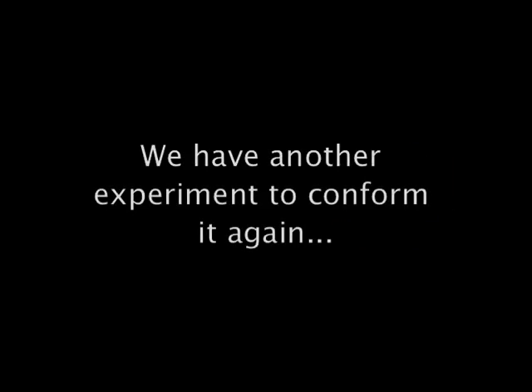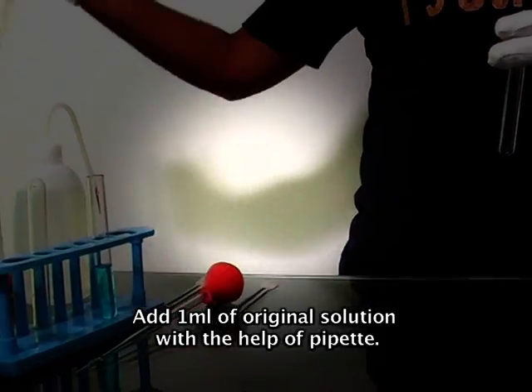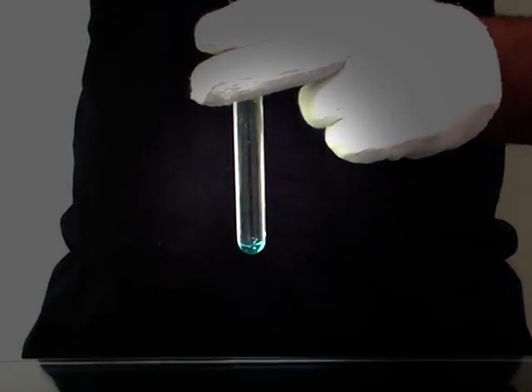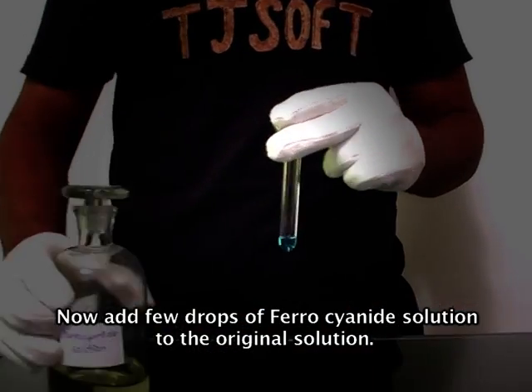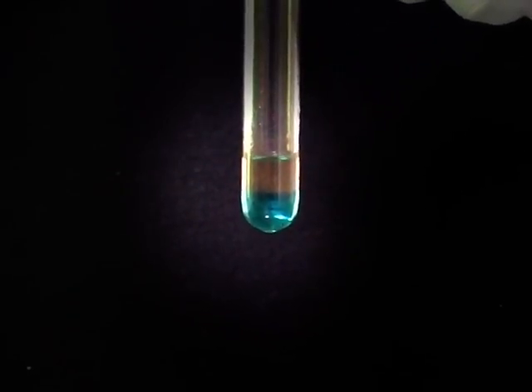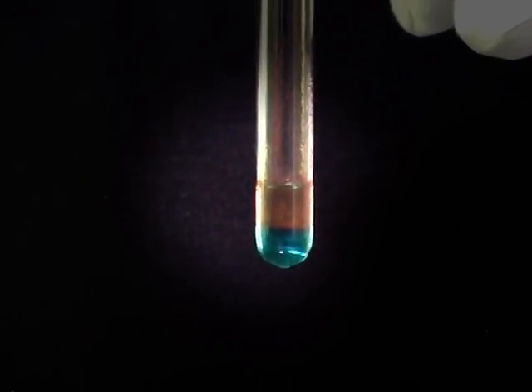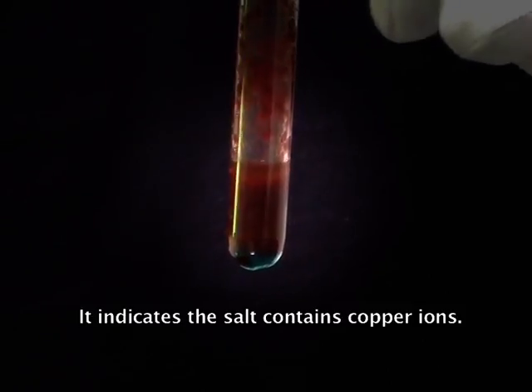We have another experiment to confirm it again. Take another clean test tube. Add 1 ml of original solution with the help of a pipette. Now add a few drops of ferrocyanide solution to the original solution. Observe here — a chocolate brown precipitate is forming in the test tube. It indicates that the salt contains copper ions.